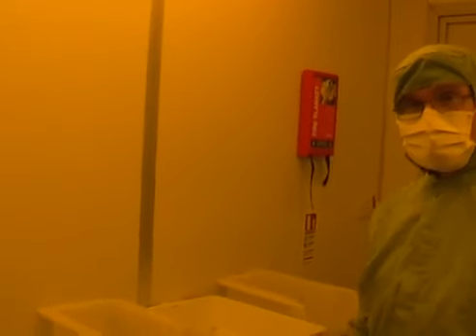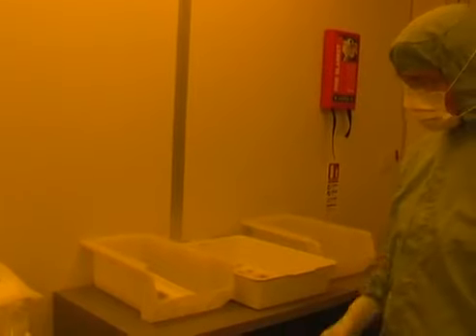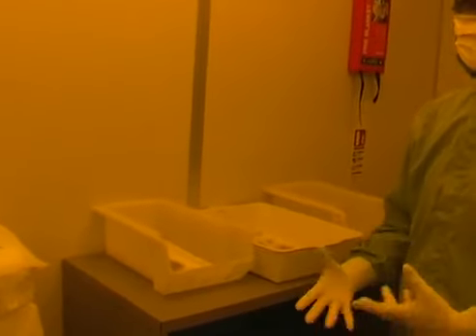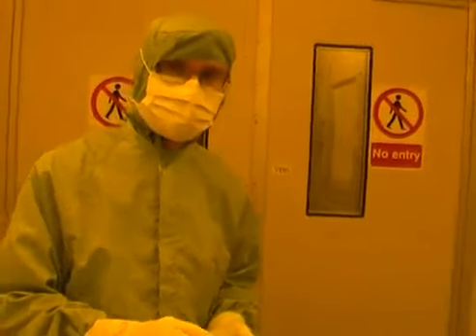Okay, so this is the box where users put their samples when they submit a job to the VB6. And what the operator does is come here, find a sample, and load it in first of all. So I'll take this sample here, which you might like to look at closely, and we'll take it through into the control room.